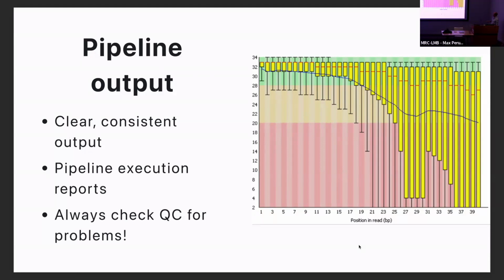So the first nucleotide has a good quality, and then you can see the quality score starts to disintegrate a little bit as you go along the read. Actually, this is a good quality run. But imagine if all your sequencing data were in the red here with very poor quality. I'd really think very carefully before you actually go ahead and analyze this data, because it's probably going to be rubbish. So that's the sort of thing you need to check.